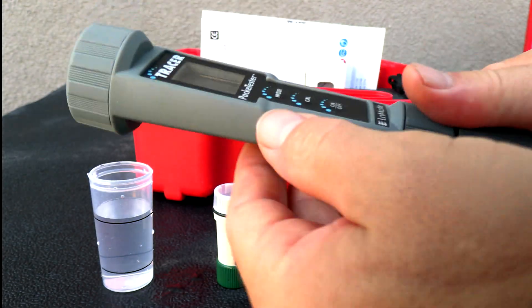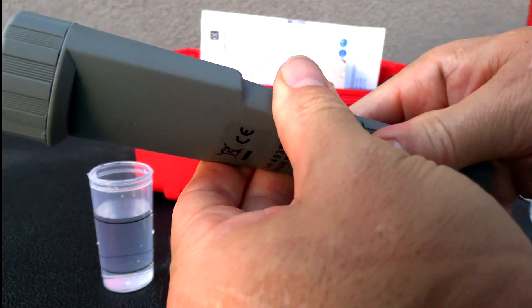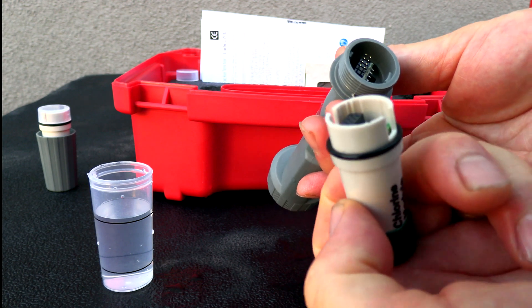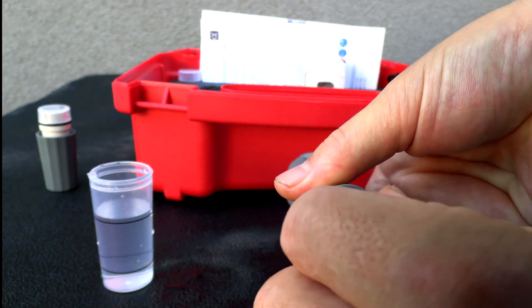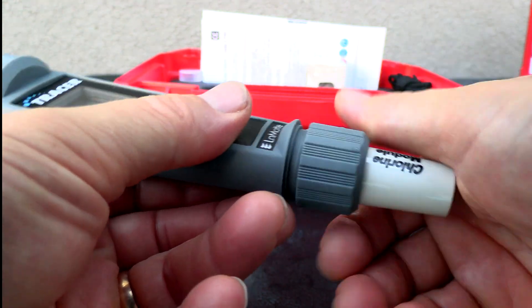Then we go ahead and put the chlorine module on. Simply take your hand and untwist the PH module, pull the module off, and attach the chlorine module. You can see the pins inside need to line up. Go ahead and put the nut back on to secure the module.